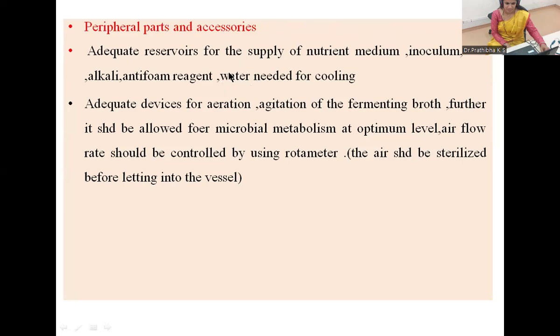All the reservoirs are very important. That should be filled. Adequate devices for aeration are very important. That is the sparger. Then agitation, impellers for fermenting broth. And further, it should be allowed for microbial metabolism at optimal level. And airflow rate should be controlled by using the rotometer.